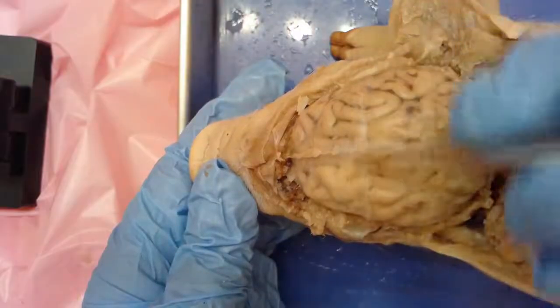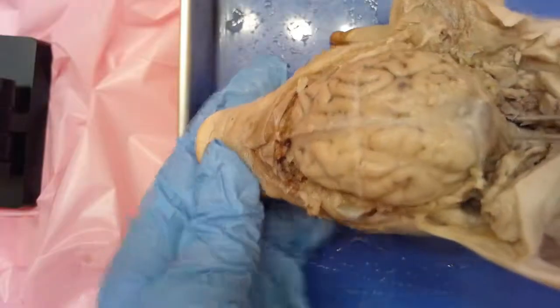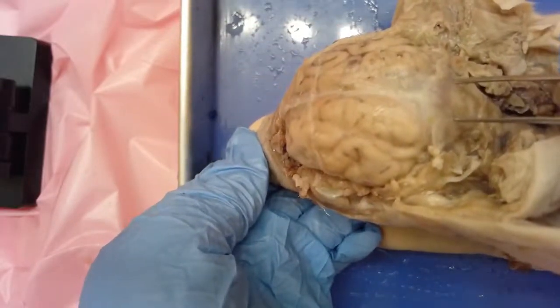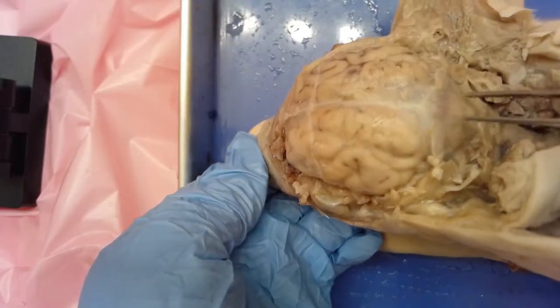So to recap the cerebrum: we have the cerebral hemispheres, the longitudinal fissure, and the little ridges and valleys. Then the very back of the brain is going to be our cerebellum. It looks a little bit smaller — it is a smaller section of the brain.